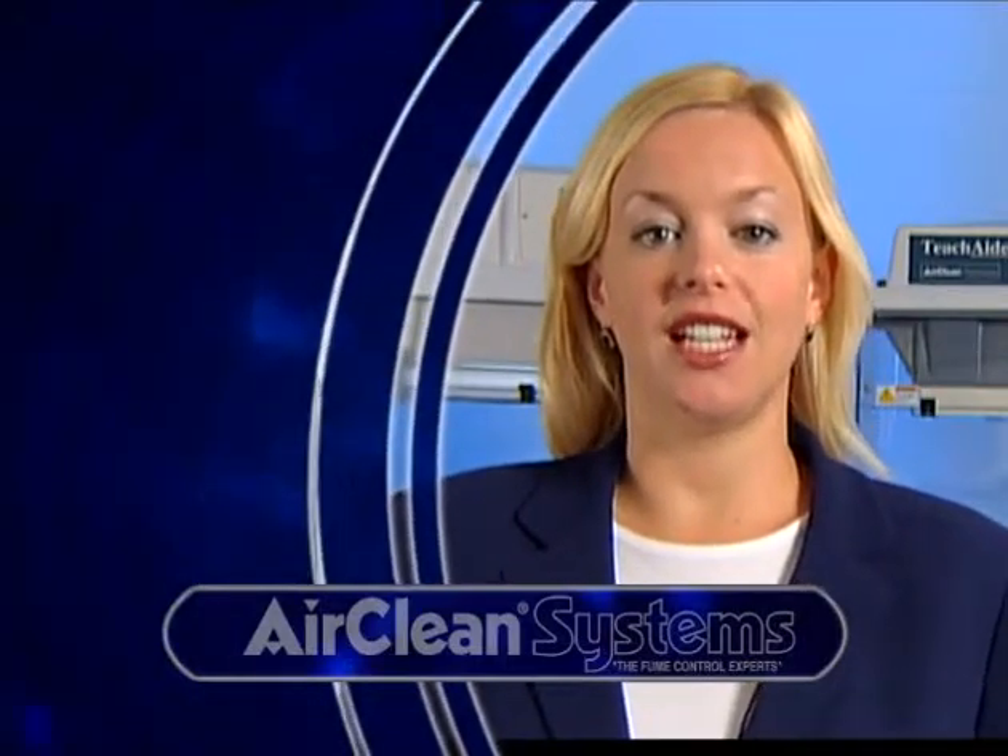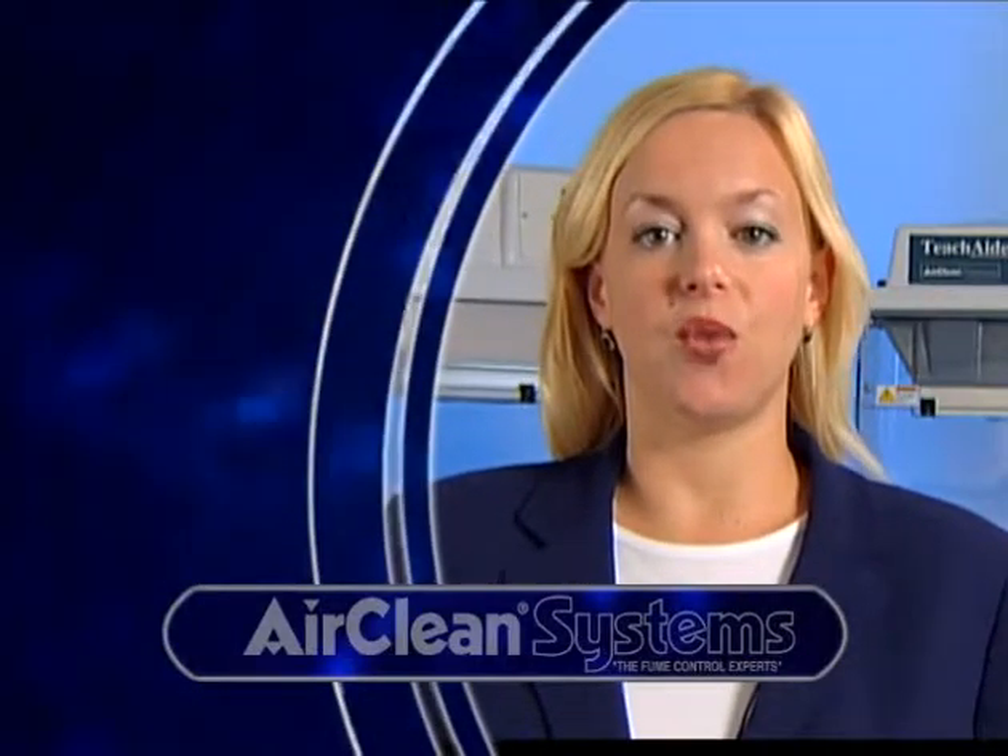Welcome! AirClean Systems would like to thank you for your interest in our TeachAid Douglas classroom demonstration workstation. We hope this video will provide you with the necessary information to evaluate TeachAid as a safe and effective workstation for your scientific experiments.